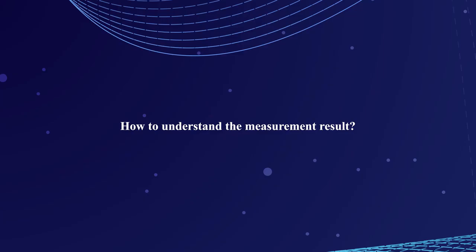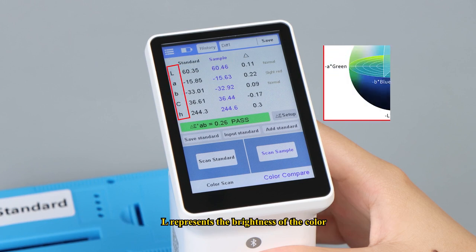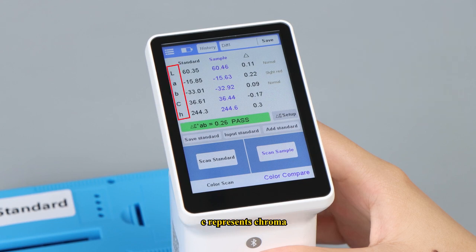How to understand the measurement result? Standard refers to the color of the standard, while sample refers to the color of the sample. L represents the brightness of the color. A and B represent two color axes — A represents the red-green channel, and B represents the yellow-blue channel. C represents chroma, and H represents hue.